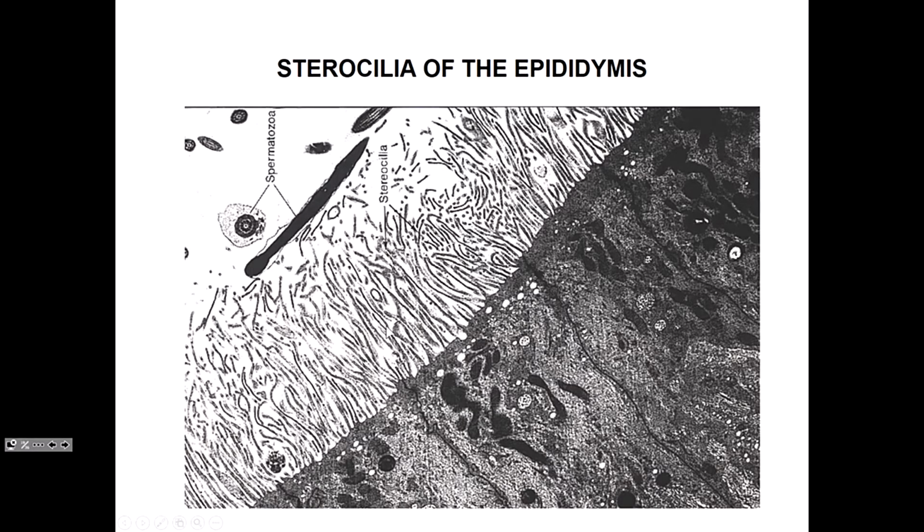This might seem a little bit daunting now, but as we go along, this will become second nature to you. It'll build upon itself, and you'll really get a much better feel for identification and classification. As we get into the organ systems, we're going to look at very specific structures that make up an organ and how they work, and you're going to be able to classify those epithelia relatively easily, just because you've seen these different structures over and over again, and you compare and contrast to other ones that aren't quite the same.